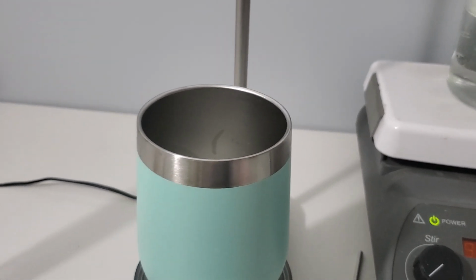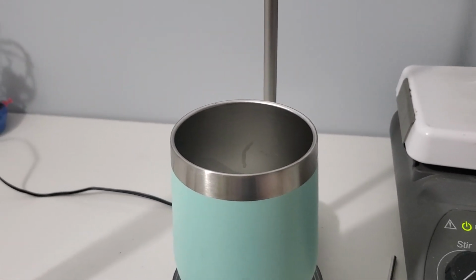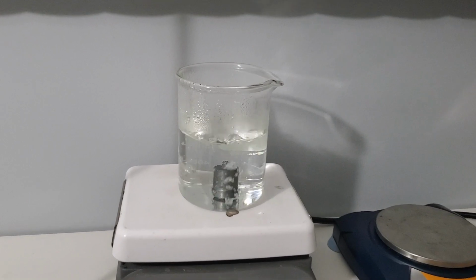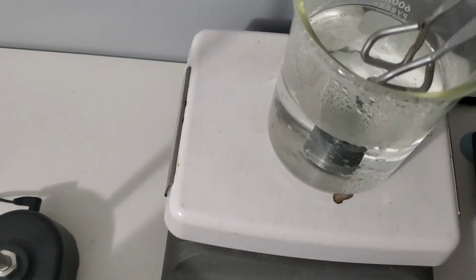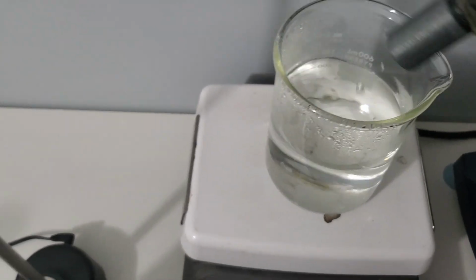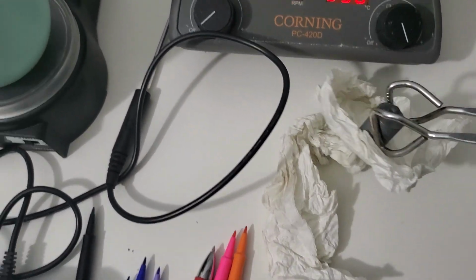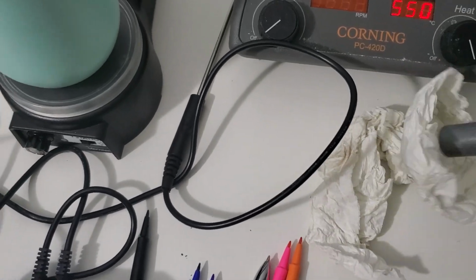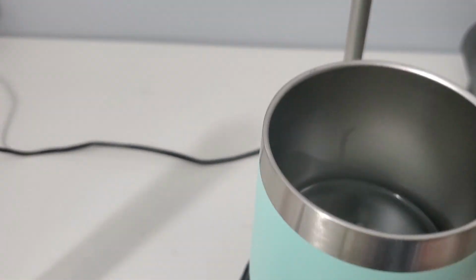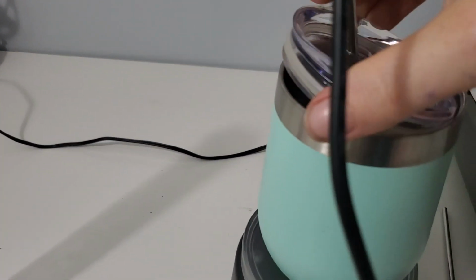So let me move this out of the way since it's going to be wet. All right. So I've grabbed it. Let's roll it around. That's good. Oop, I dropped it. There we go. Into there. And I got the stir going.